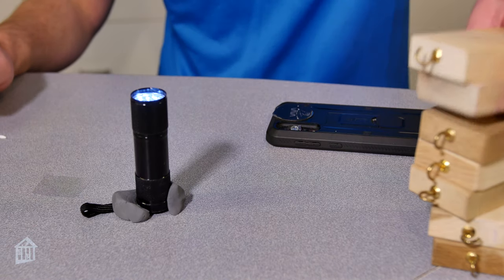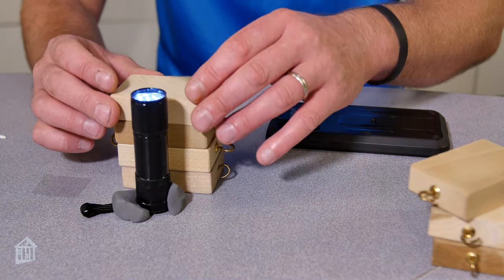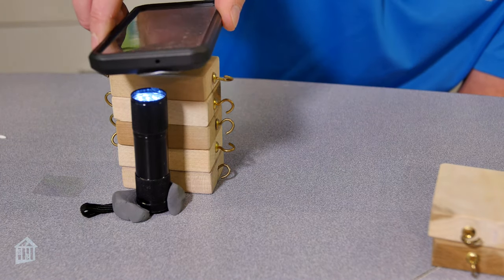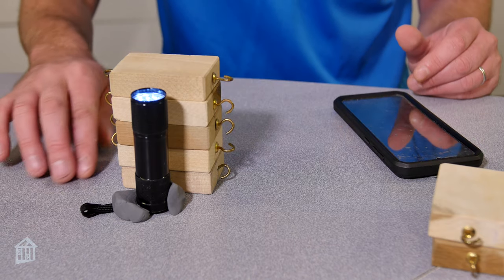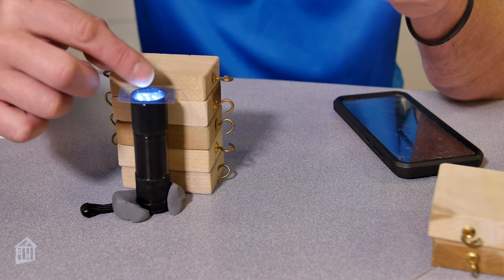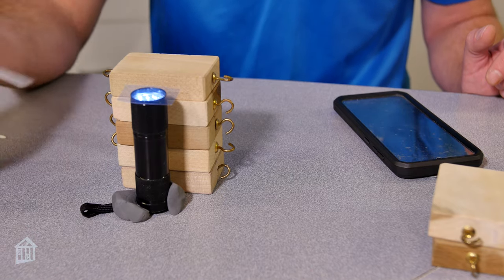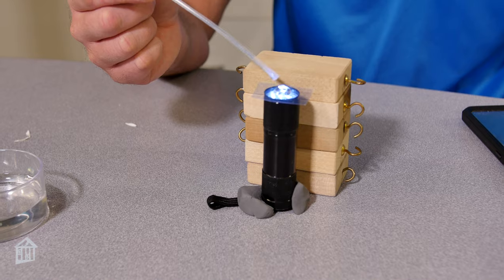Once your flashlight is secure, you'll take the blocks and stack them next to the flashlight. This is going to be the base that holds your smartphone. You'll want to make sure that the camera lens is very close to your flashlight, so this might take some adjustment. Once it's lined up properly, you can take your piece of plastic and place it over the flashlight. Then take a pipette and get some of the water from the pond or puddle, and place it onto the piece of plastic over your flashlight.